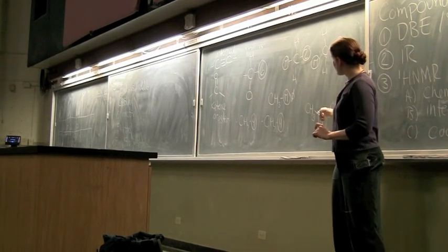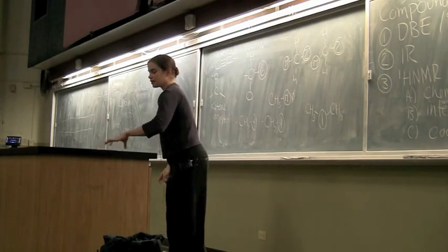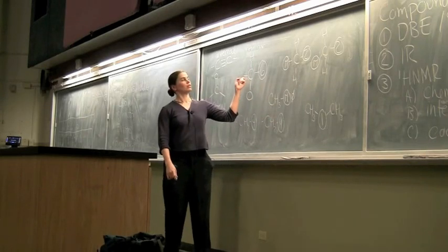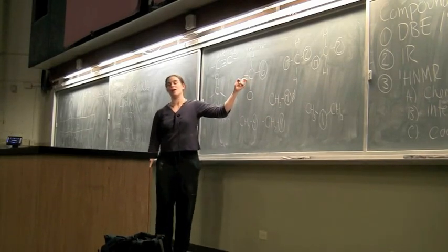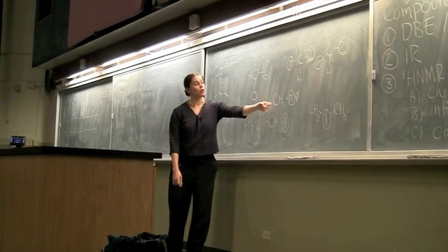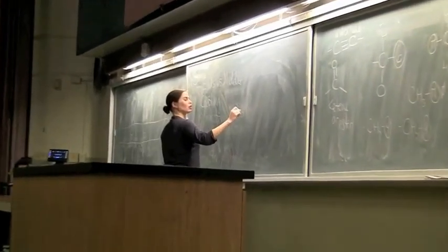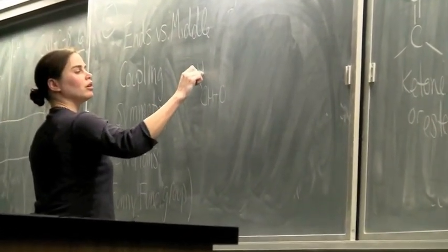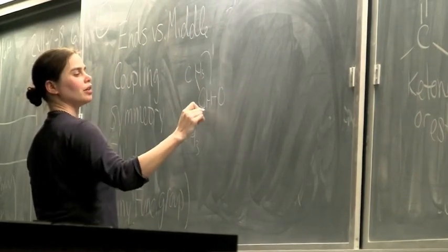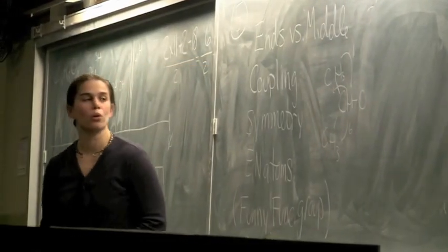So we've got this symmetrical group. They're right next to one hydrogen. We need to find somebody, some 1H, we can put them next to. There's only one 1H in that molecule, and that's got to be it. It's the only place we can put that. So we get those two CH3s are next to our CHO. These guys have 1 neighbor, this one has 6. All works out.